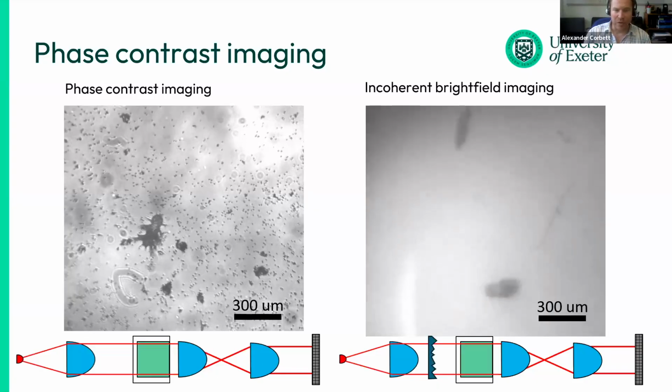But basically, by providing a very strong collimation of our LED source by using these collimation lenses, we are then very sensitive to any phase variations across the sample. And so wherever there's a phase gradient, we will see that interpreted into the intensity in the collected image. Okay.